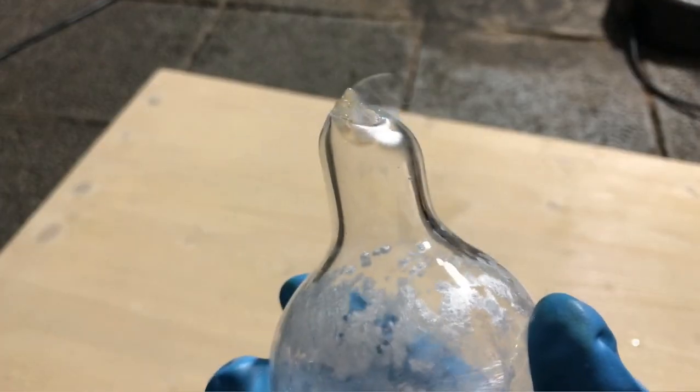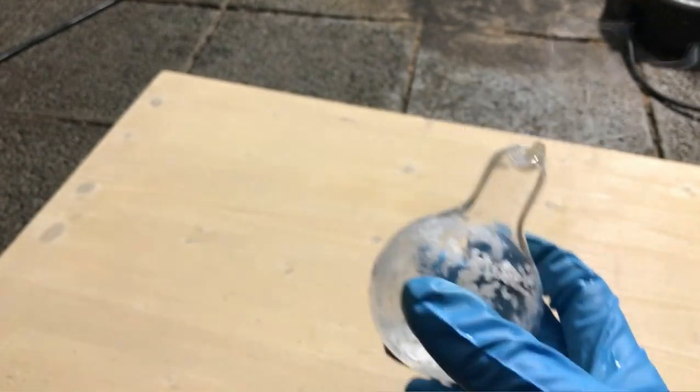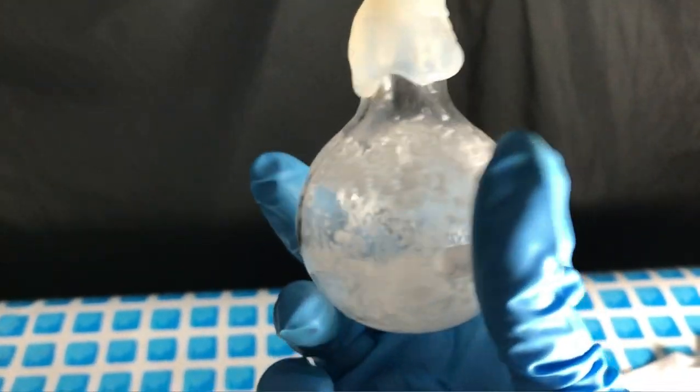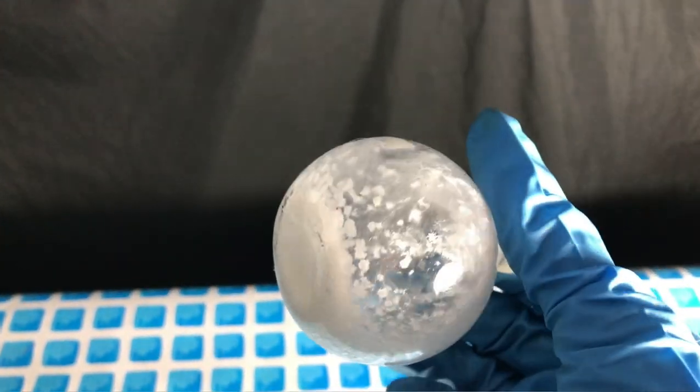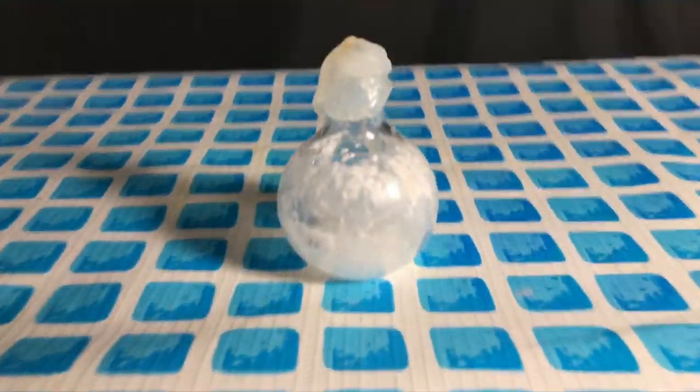To get back to the damaged ampule you can see some vapors escaping. It can obviously not be stored like that. For short term storage, aka a few days, the top was sealed using hot glue. We will have to destroy that sulfur trioxide as quickly as possible and I appreciate any ideas you have. Put them down into the comments and I'll try to do it.